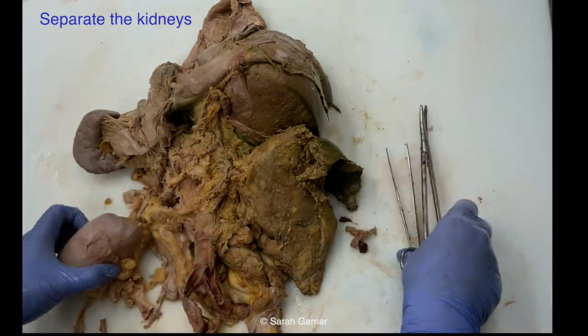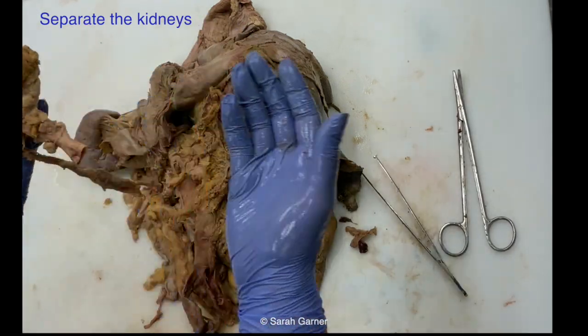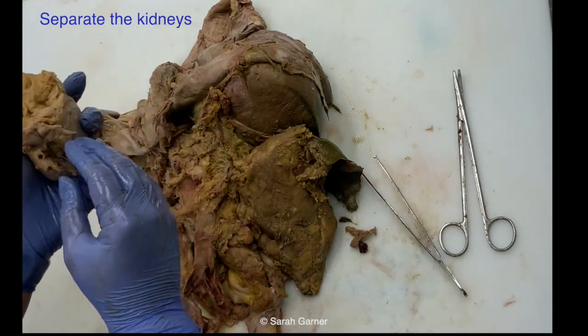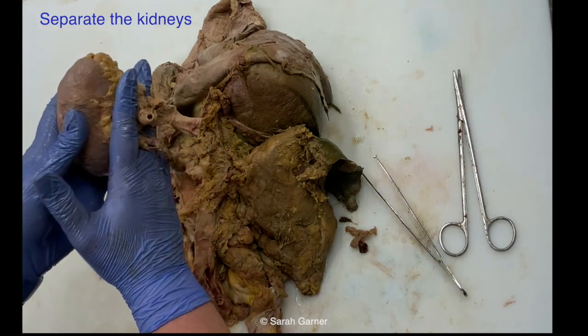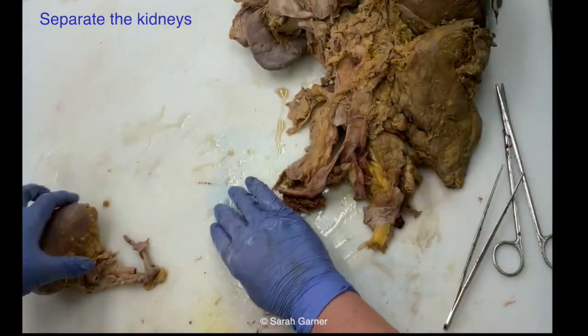because if you just try to cut this in half, you're not gonna get a good view of the calyceal system. And what's the point of opening it if you're not getting a good view, right? If you're gonna do it right, you can open up the vessels, open up through the ureter. Once you've inspected the inside before you weigh, then you can trim them at the hilum, okay? So I'm gonna just go ahead and do that because we're talking about it.